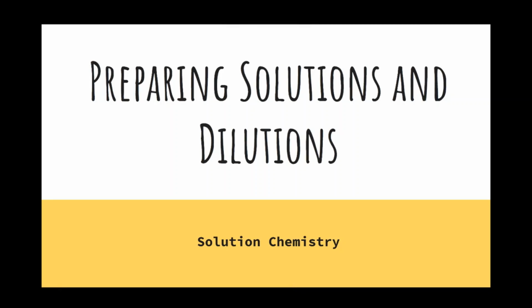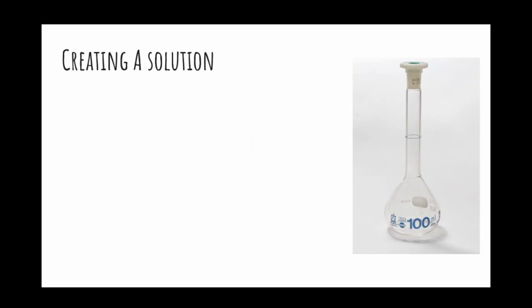This video is going to be looking at preparing solutions and how to make dilutions. So let's go ahead and get started and talk a little bit about how we make solutions of different molarities. Creating a solution.